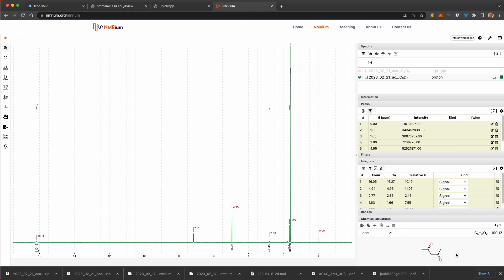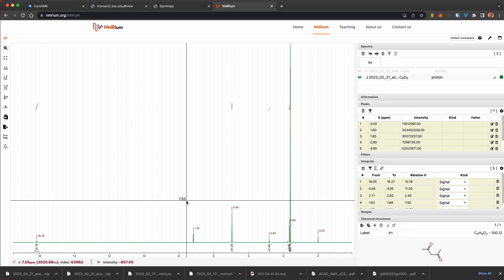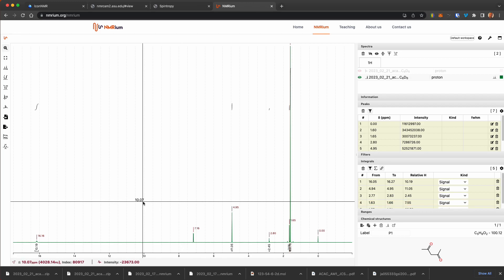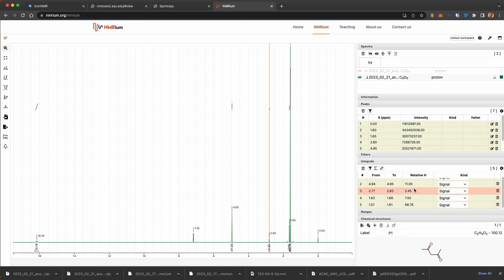And so now you can even assign these signals. So we could have, this is showing the keto version. We could add to P2, the enol version, and then even tell it which of the structures each of these is. So now we can look at the relative area of each of these to figure out how much ketone and enol is in solution, which will tell us the equilibrium constant for this.